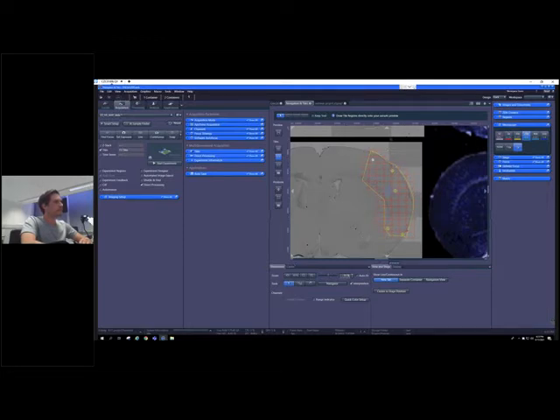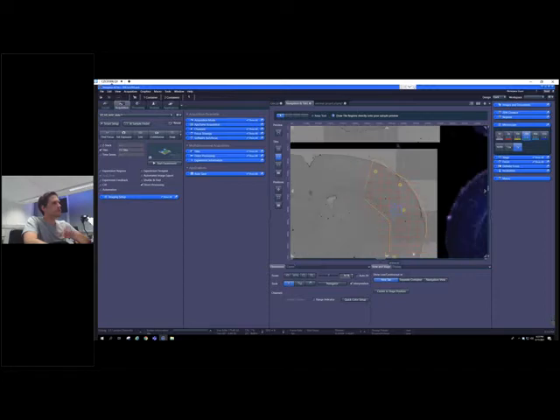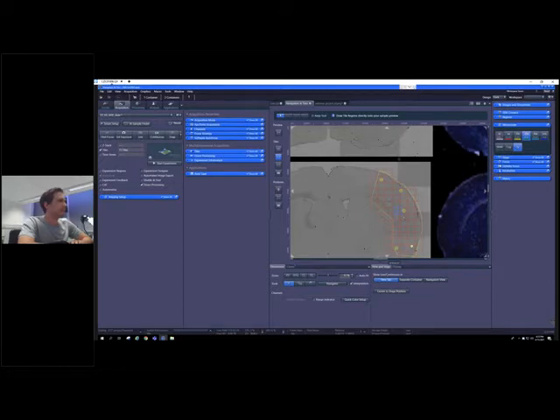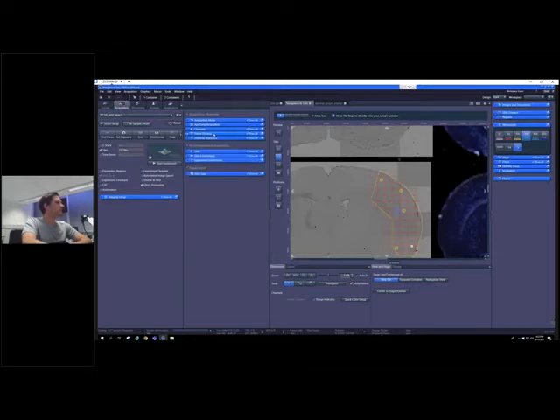All right, as you can see, I've assigned a tile region, and I just briefly mentioned there is also a new feature within this software release, which is an automatic distribution of focus support points. Those are the yellow spots you can see here in the tile region. And basically on those positions which have been distributed here with some algorithm, the system will, upon starting the acquisition, run according to the strategy here an automatic detection of the focus points, and then run the acquisition through it.